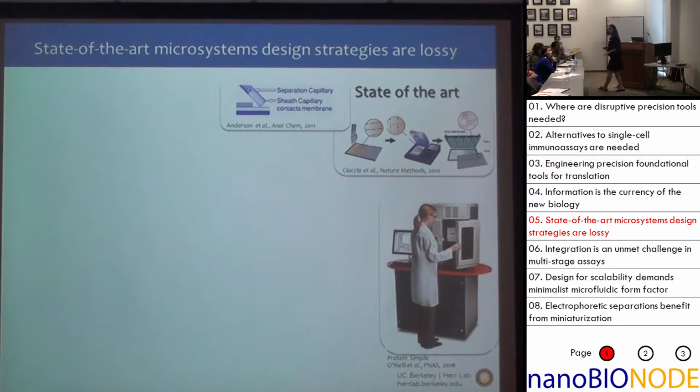So there's been some really exciting developments in the area of these so-called multi-stage assays, right? So the Western, there's sizing, and then there's the immunoassay, so it's multiple stages to the assay. It's not just a simple immunoassay. There's some new instrumentation that's on the market. Protein Simple has a really cool system that basically makes a Western blot look something like this. It's all in kind of a box. There's been some work with these really large format gels. So if you run a conventional Western, your gel is probably going to be about that big.